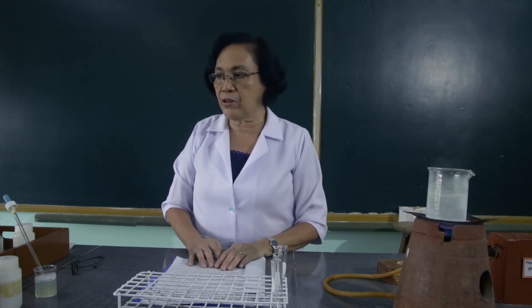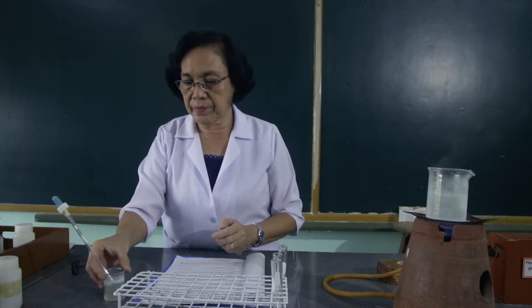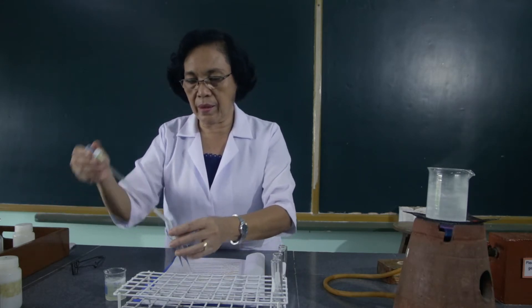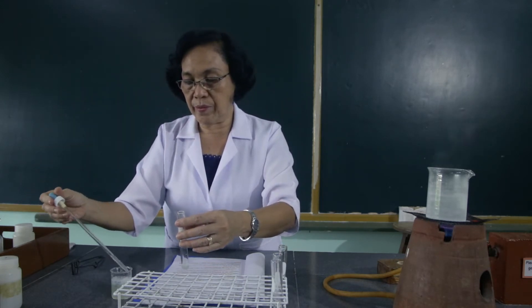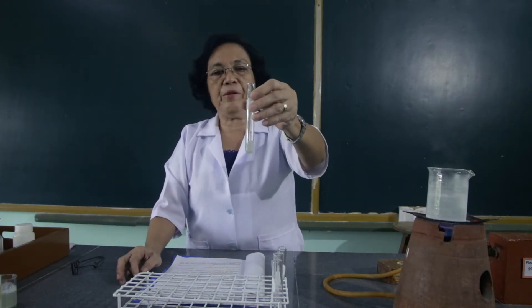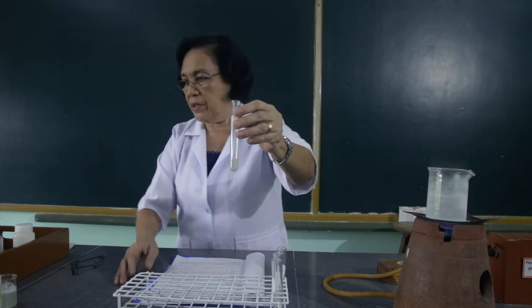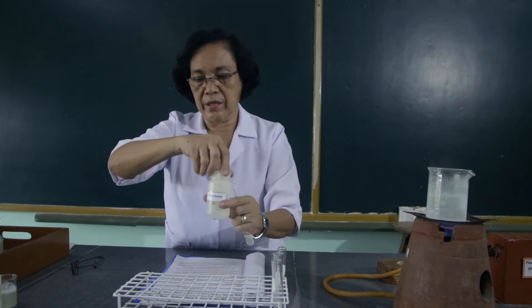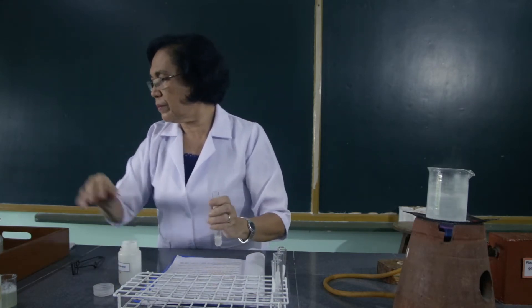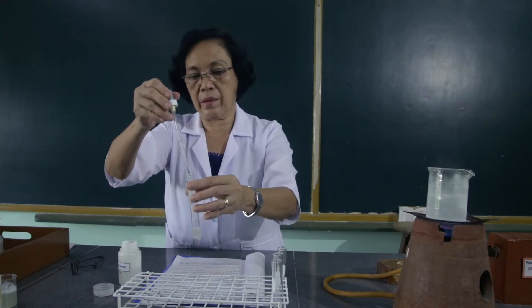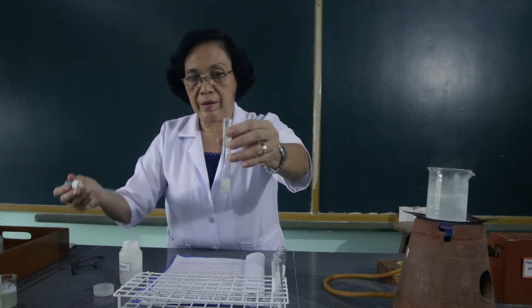For the next precipitation reaction, we are going to add ethyl alcohol to the egg albumin. We will use 2 ml of the egg albumin and we will add it with 4 ml of the ethyl alcohol. So this is the ethyl alcohol. Observe what happens.